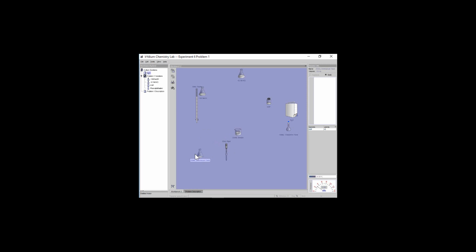I have my Erlenmeyer. Usually for a titration, I want to repeat it multiple times. So while I'm at it, I'm just going to pull out 2 more Erlenmeyer flasks. Yes, with the magic of a virtual lab, you can even Control-C, Control-V. I just want to demonstrate to you how you would do this in a regular lab. So let's take this pipette here. Let's pipette out again 10 mils, withdraw solution. Let's transfer into the 10. So that's my second container. And then let's do that one more time. Let's take that pipette. Usually we like 3, so that way I can compare, was it a fluke that I got a certain number? In this case here, I'm just going to drag my pipette. Now I have 3 solutions ready.